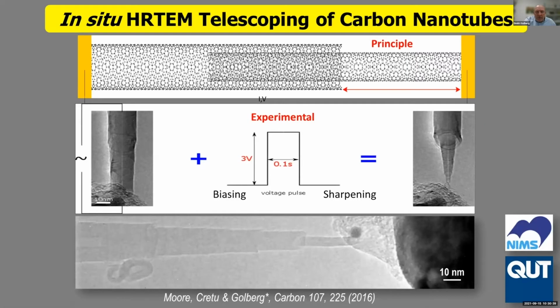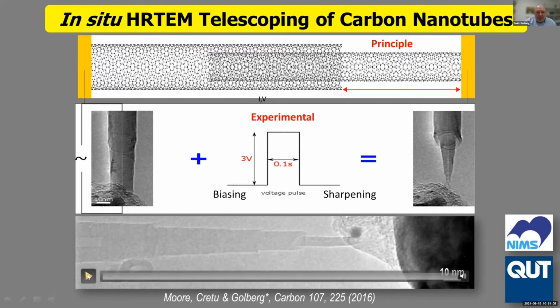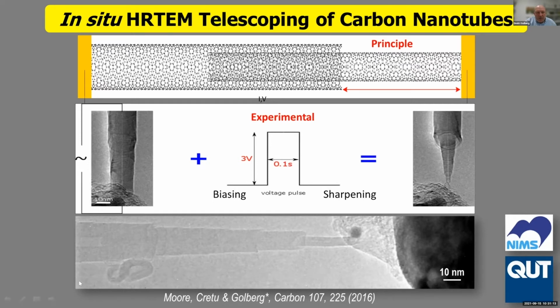And for this, I want you to see this very nice experiment which we performed in Japan. Catherine was my GSPS fellow from Australia, actually. We decided to make some type of core shell structure made of carbon layers. The parameters are shown here, and then put some bias. And in addition, we can make a connection to the core separately and look at what was going on here.